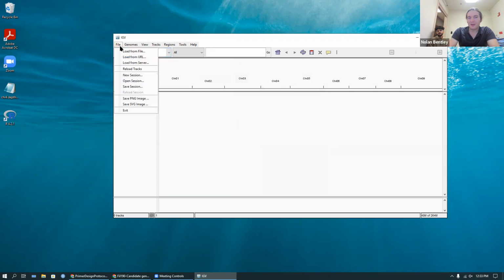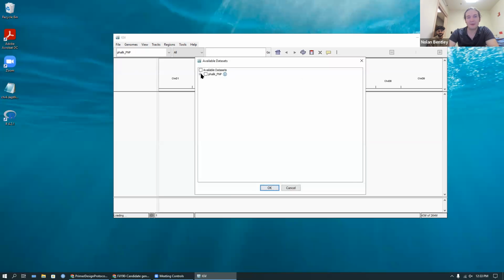So you don't really want to download them all. It's a humongous amount of data. You would be waiting a long time and eventually probably run out of room. So there's several different data sets. These are just all of the DELLY information. It's not terribly useful to visualize. Unfortunately, it's just too much data. This is the other type of variant analysis that has been done. These two combined is what's currently available on the variant browser for this population.